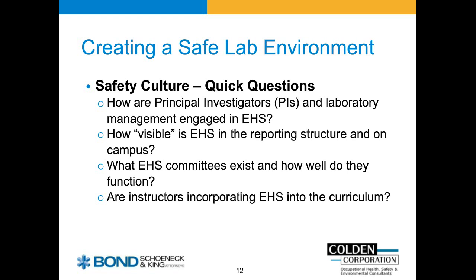And then lastly, and I promised Barry I wouldn't stump on this one too hard, are instructors incorporating EHS into the curriculum? As Barry mentioned earlier, the students are not covered by federal OSHA. The instructor in the classroom is, the PI in the lab is, but not the undergraduate student. And so it's a huge compliance gap. So I feel at a moral level, we have an absolute obligation to incorporate health and safety into the curriculum wherever we can. And there have been some really creative ways that folks have done that with our clients.